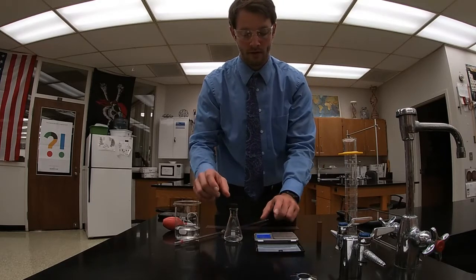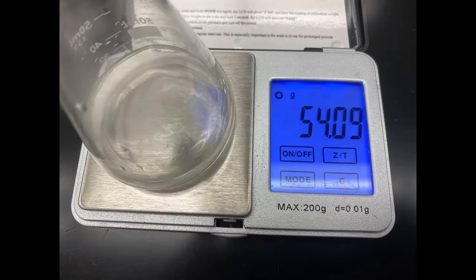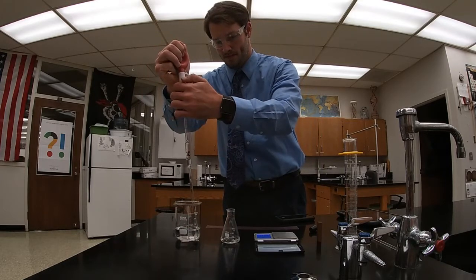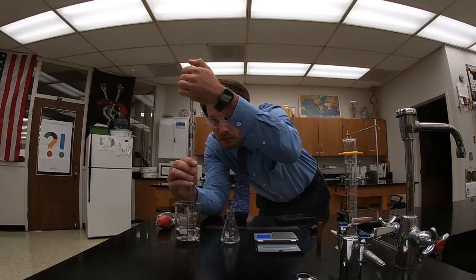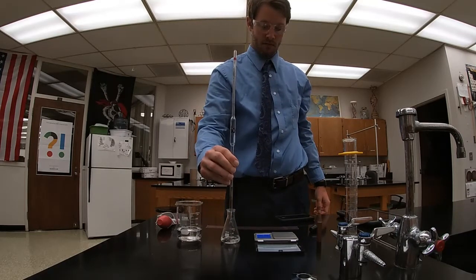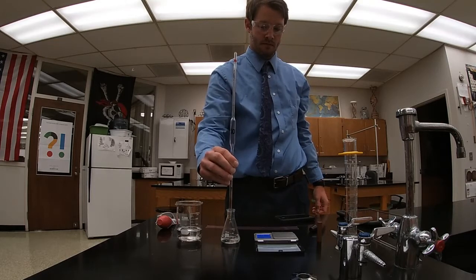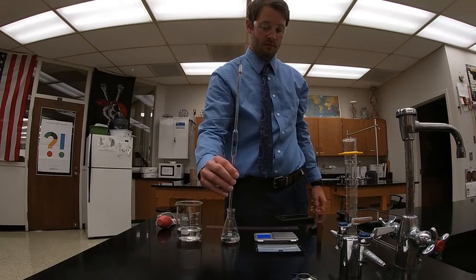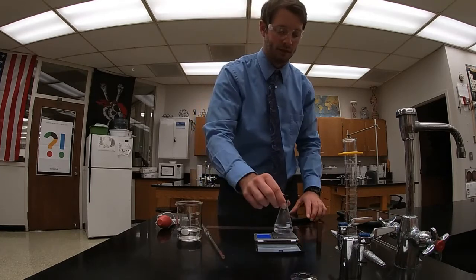Stopper the flask, and get the mass. And then I'm going to remove the flask, add the second 10 milliliter portion, stopper the flask, replace the flask, and get the new mass.